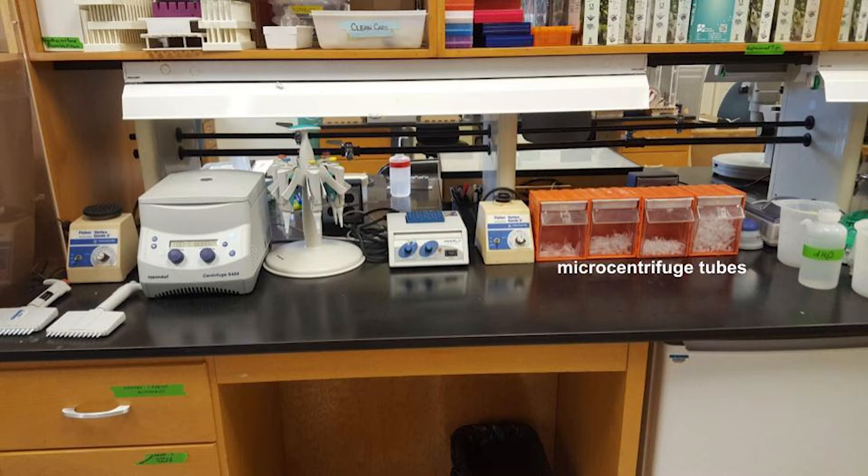Now let's take a closer look at some of the equipment on this lab bench. In these orange storage containers we keep small tubes called micro centrifuge tubes. We use these when we are performing DNA extractions and other molecular experiments.